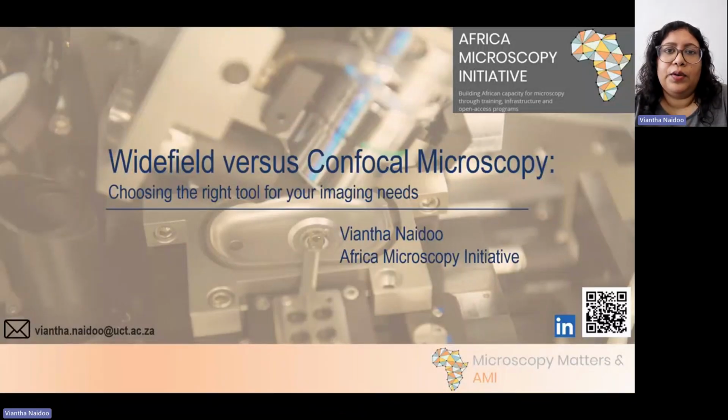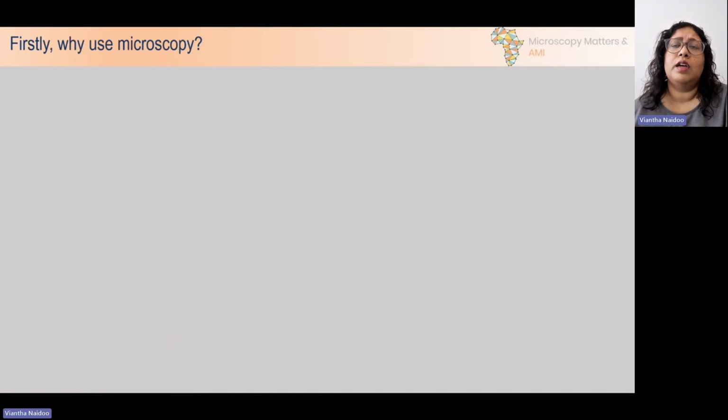My name is Viantha Naidoo, and I am a microscopy specialist at the Africa Microscopy Initiative Imaging Center at the University of Cape Town in South Africa. Today it is my pleasure to give you a basic overview of Widefield and Confocal Microscopy, particularly focusing on the advantages and disadvantages of each imaging modality in order to help you decide which one to choose for your sample type. So let's start off with why should we use microscopy at all?